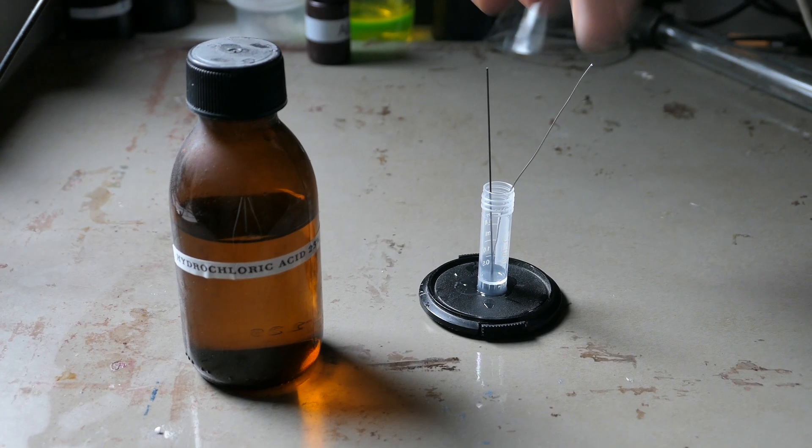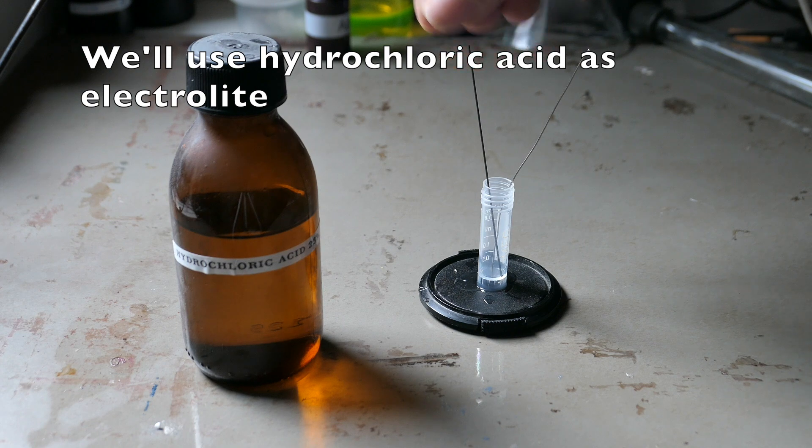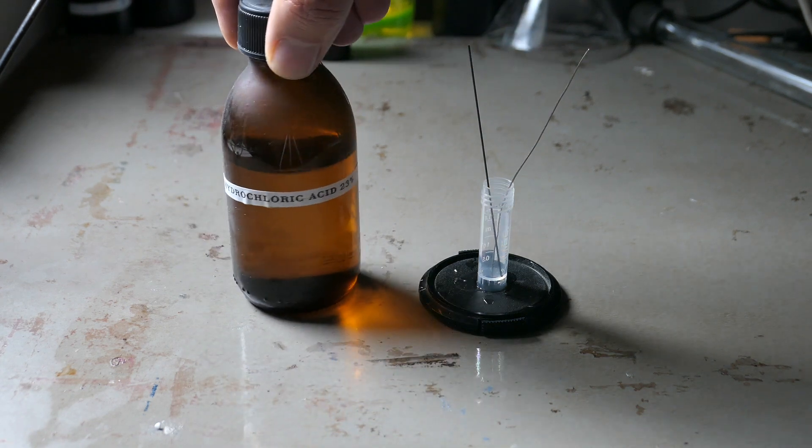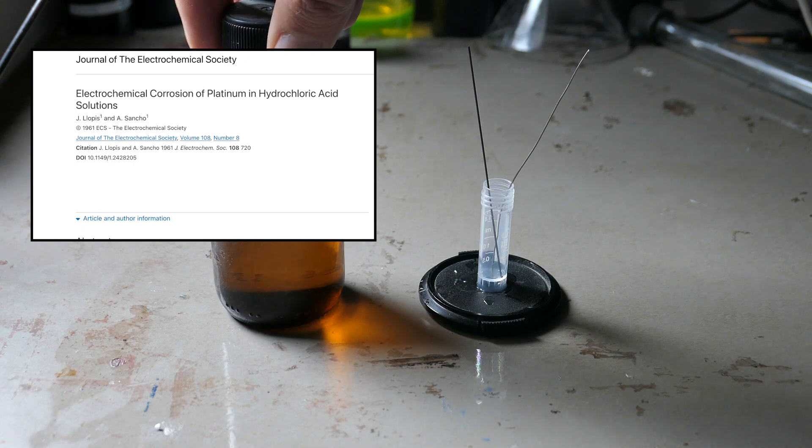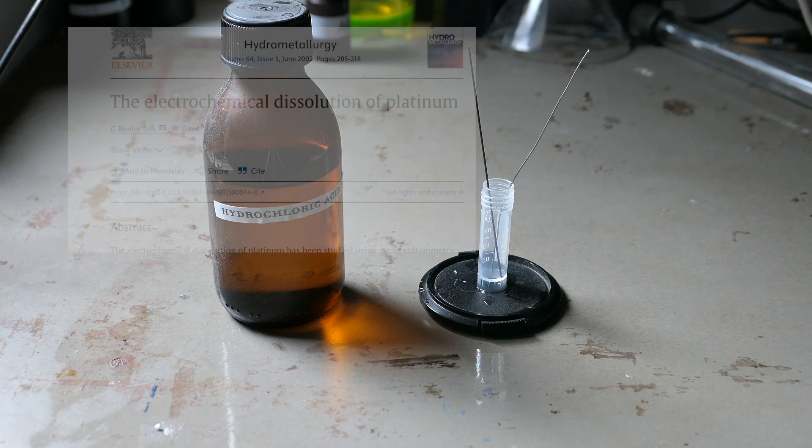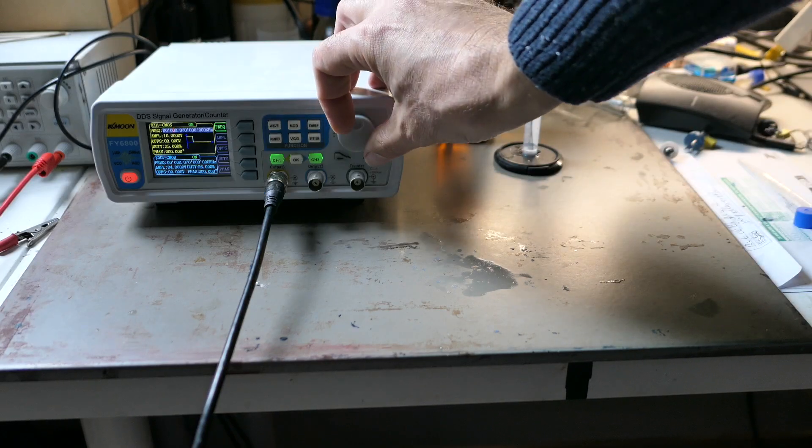For the electrolysis setup I'm going to use a carbon electrode as the cathode and the platinum wire as the anode. Several research papers explain that to prevent the platinum from passivating, it's important to use either a very low current or alternating current.